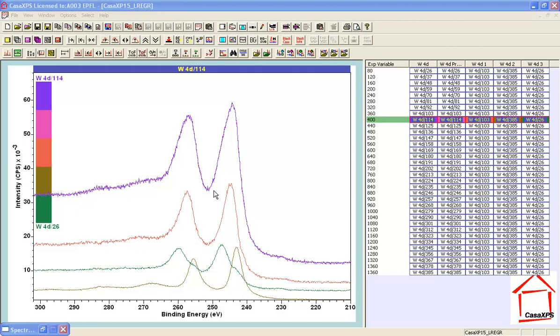The real goal for XPS is not a mathematical solution — it's to come up with solutions that have physical meaning. Whether these are physically meaningful is uncertain, but two of the three curves can be tentatively identified: one typical of a metallic shape and one close to the initial phase of the profile. The analysis shows that a third shape of the nature we see here is required to fit all the data in the profile. This analysis certainly suggests there might be three different phases within this profile — something that would be difficult to conclude without examining the data in this detail.